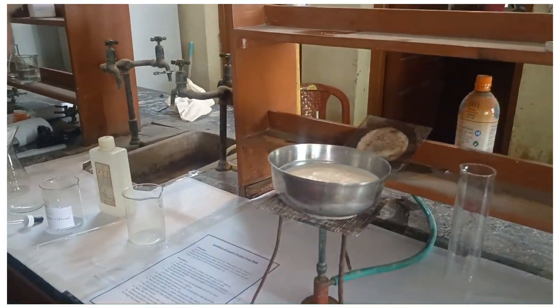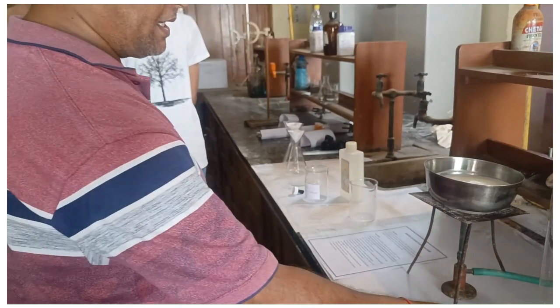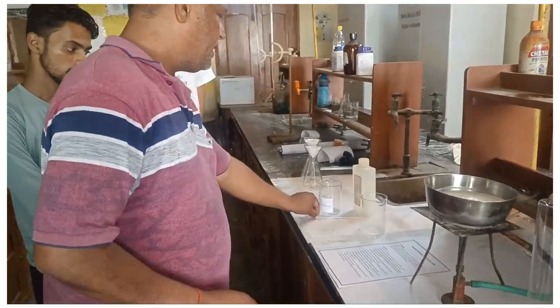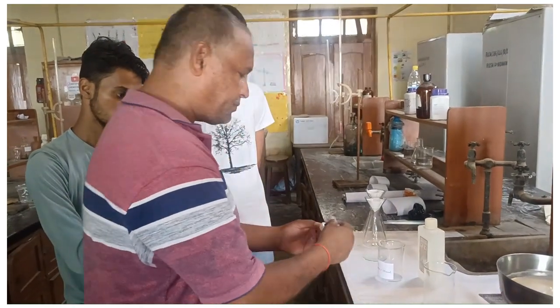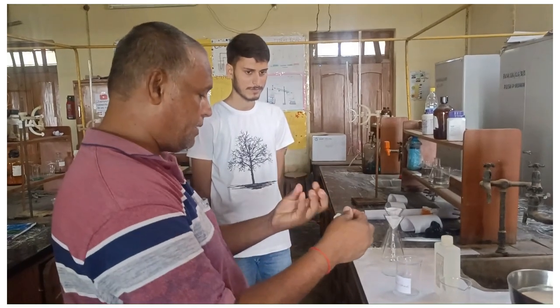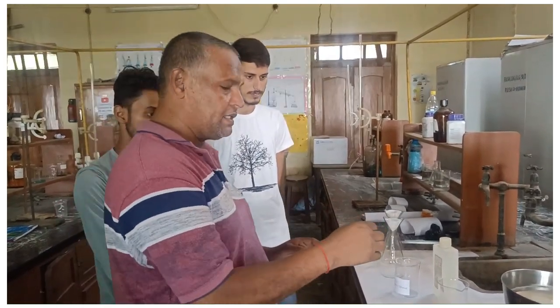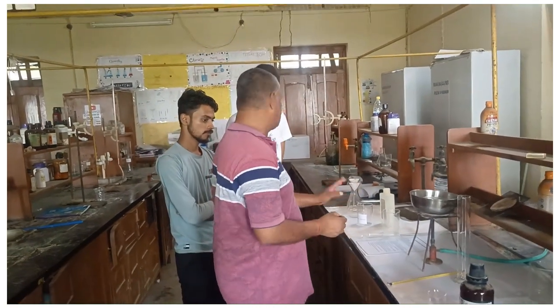So these are the chemicals, and this is the thermometer by which we measure the temperature, and this is the stirrer, which we use to stir. And this is the dropper by which we take the acetic acid drop by drop when we mix it.